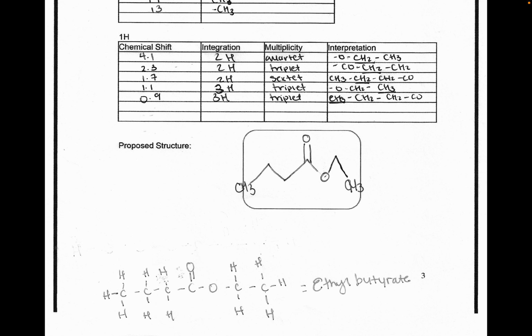It has an ester functional group. It matches every peak in my IR, 13C, and 1H NMR, and it satisfies the degree of unsaturation of 1. So all the data lines up with this structure.